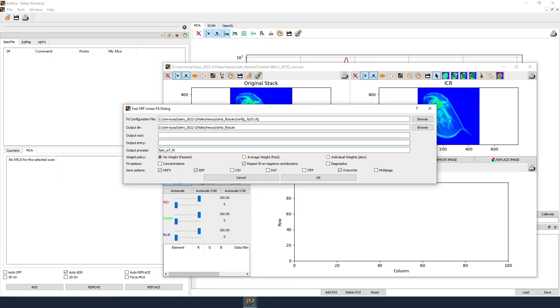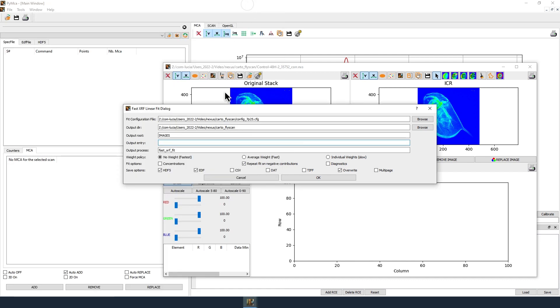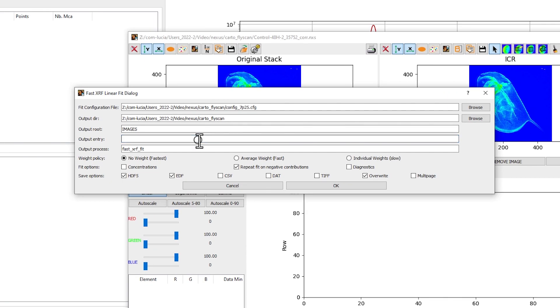In Output Dir, select the directory where you want to write the results of the fit. In this directory, a directory images will be automatically created to store the fitting results. In Output Entry, write the name of the map without the extension. To reduce error, you can copy paste the name from the file explorer.